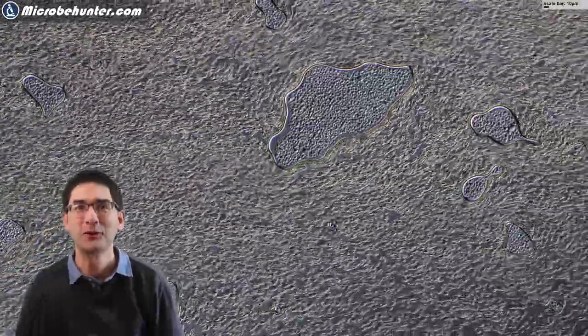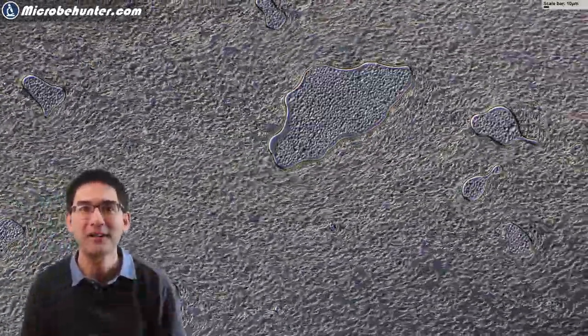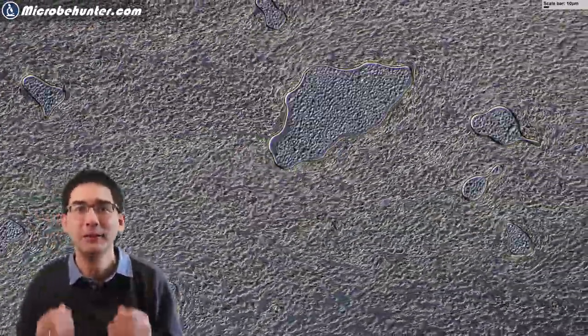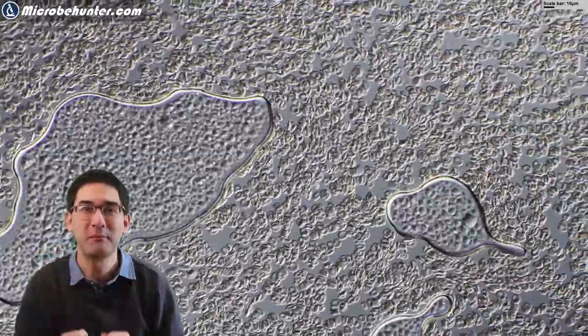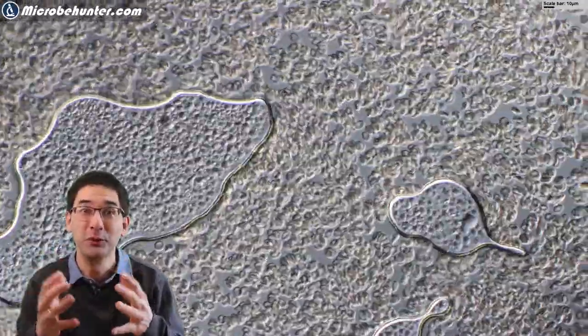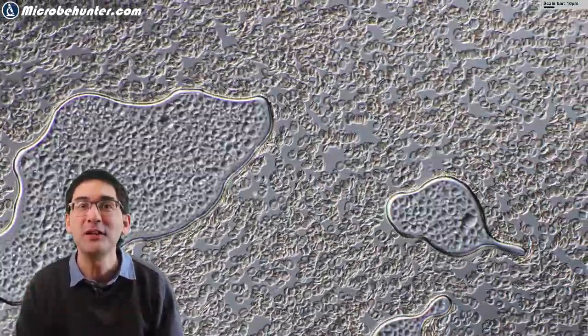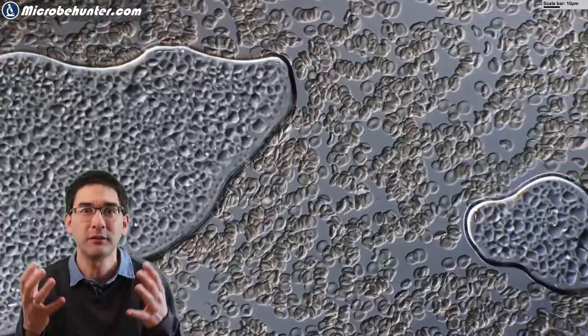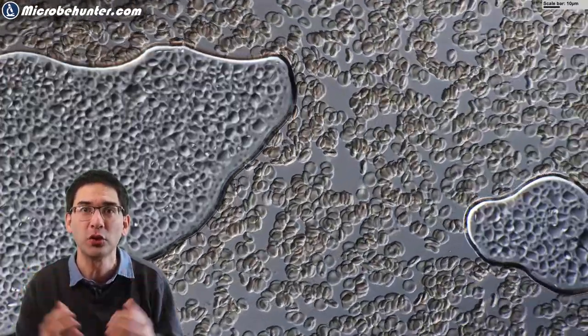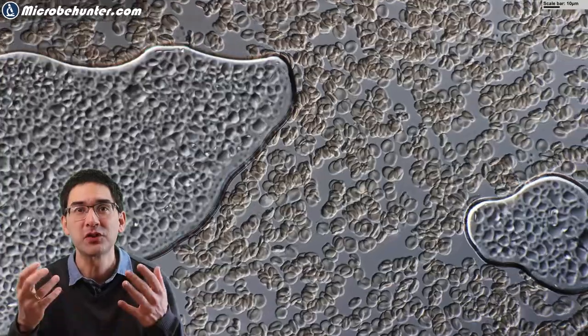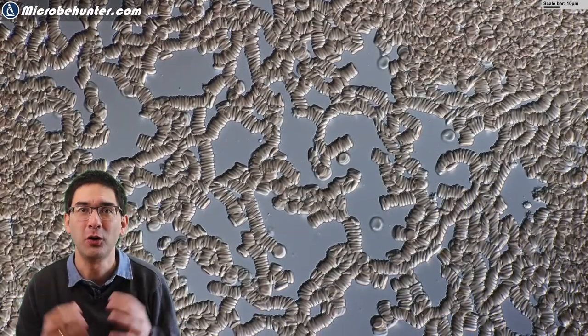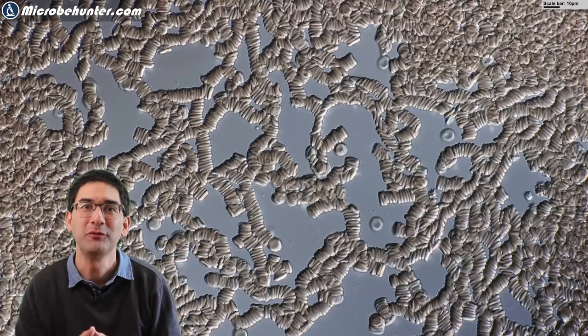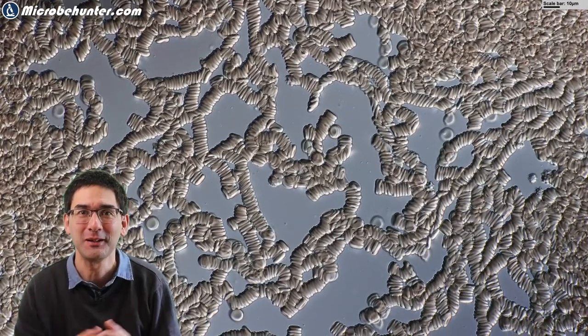Hi, hello and welcome. Microbe Hunter here. All of those fast-moving dots that you see, these are red blood cells that I got from my finger. I took a little sample from my blood to put it under the microscope to show it to you. In this video I want to show you different microscopic techniques to observe these red blood cells, and I'd also like to add a little bit of salt water and distilled water to the blood. Then the shape of these red blood cells changes because of osmosis. There are a couple of very interesting observations that we can make this way.